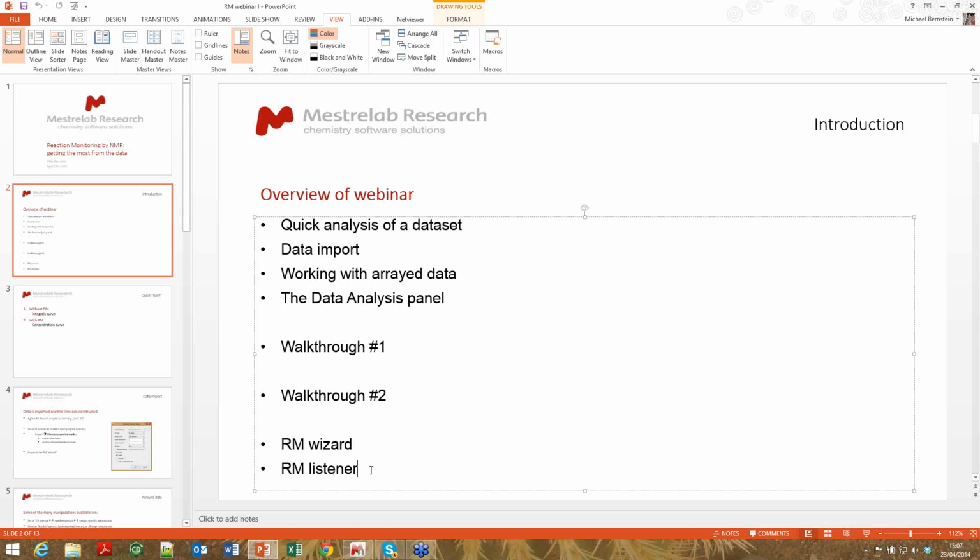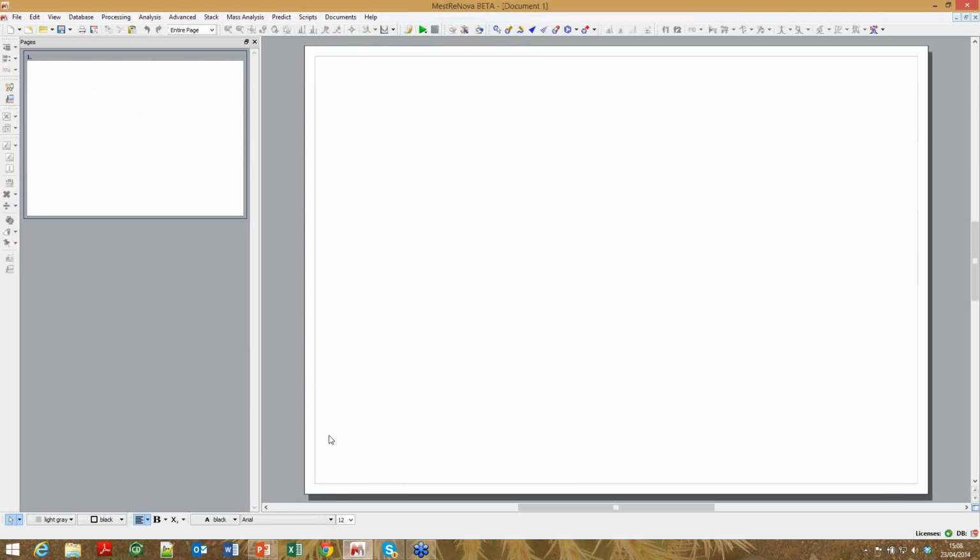So what you get with the reaction monitoring, as I say, is this ability to work in concentration versus time, and then you also get these two at the end here, the wizard and the listener. So let's crack on without further ado and get to the meat of things.